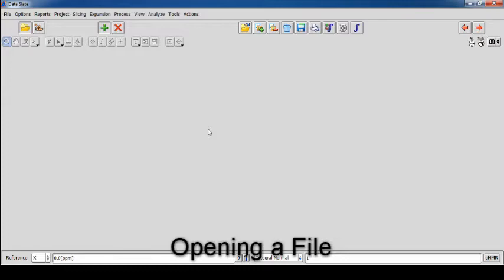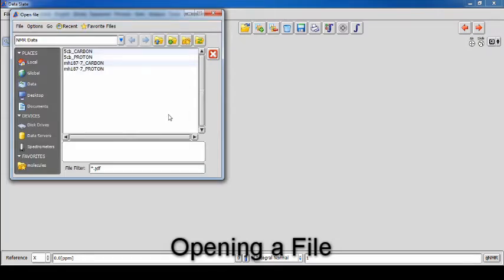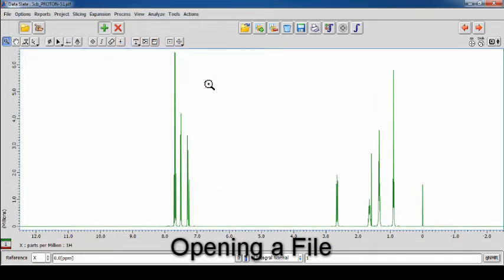From here, we can open a data file. This can be done in one of two ways. The first method is to use the File Explorer. First, ensure Open Data from Disk is toggled on. Then click Open Data File. This will open the File Explorer. Browse for the file you want to open, select the file and press the green tick. This will open the data file as a new geometry instance on the dataslate.